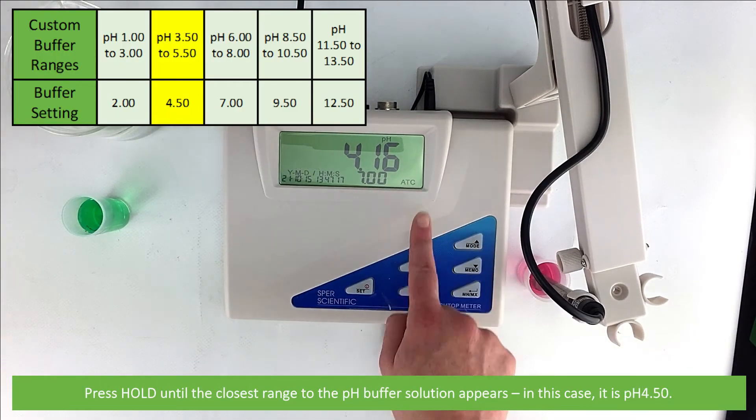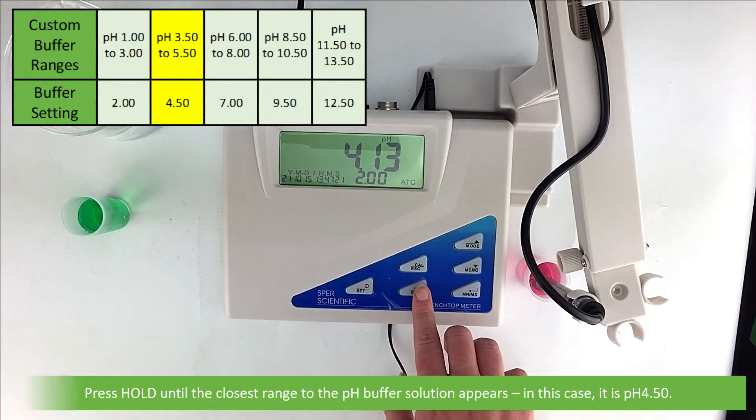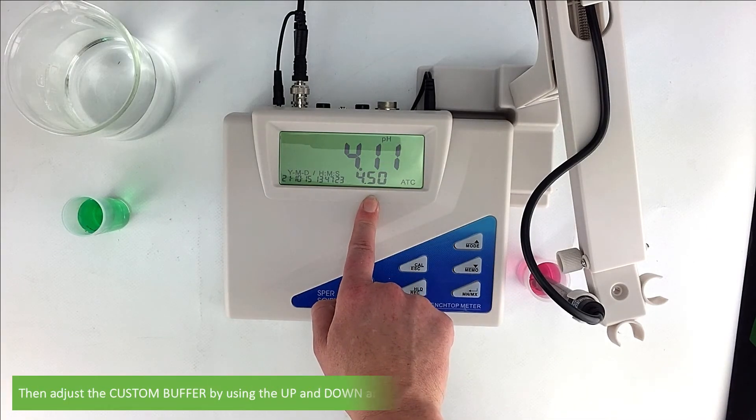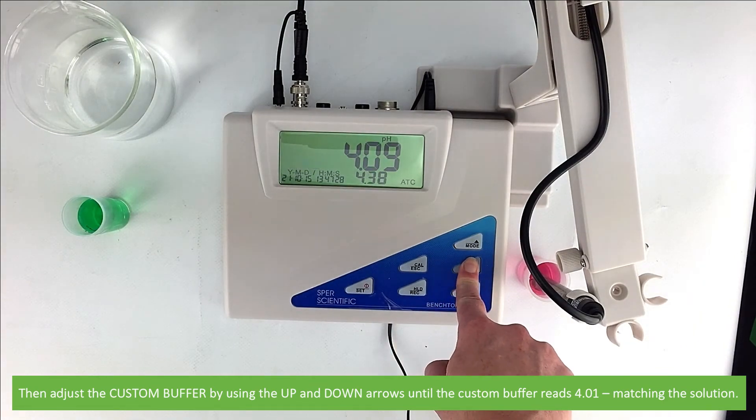Press hold until the closest range to the pH buffer solution appears. In this case, it is pH 4.5. Then, adjust the custom buffer by using the up and down arrows until the custom buffer reads 4.01, matching the solution.